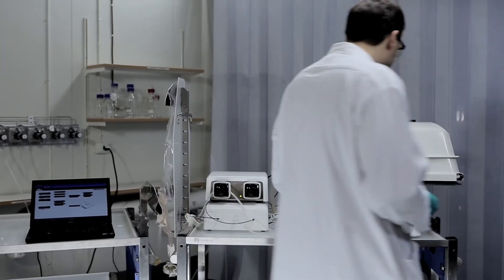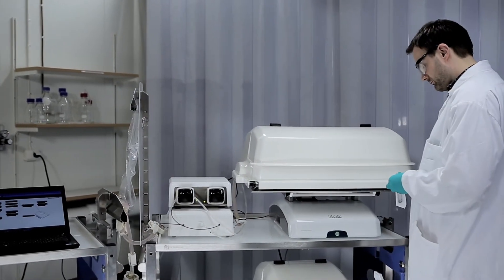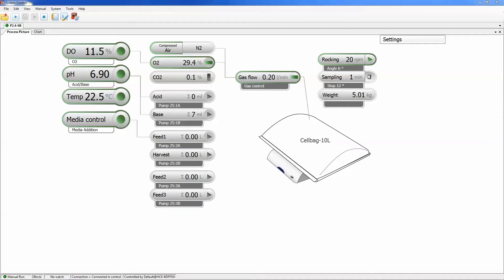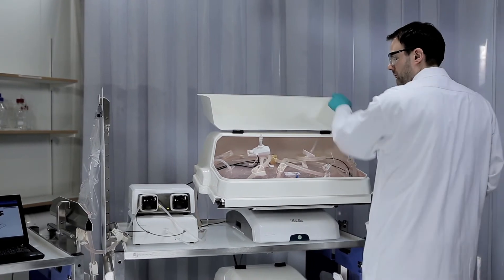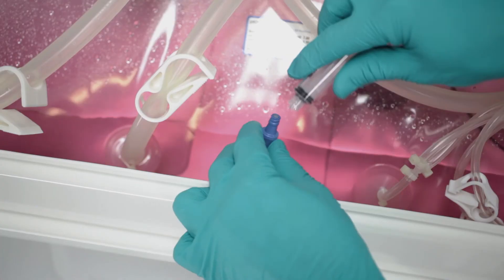Sampling can easily be performed when needed. When using the Unicorn Pause function, the system halts in a convenient position. The system can be set to restart automatically after a specified period of time.